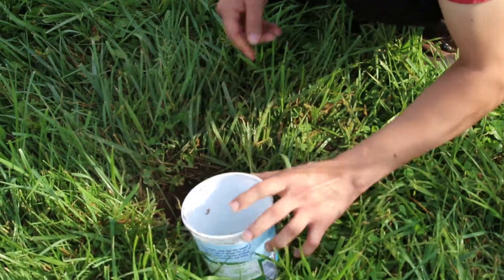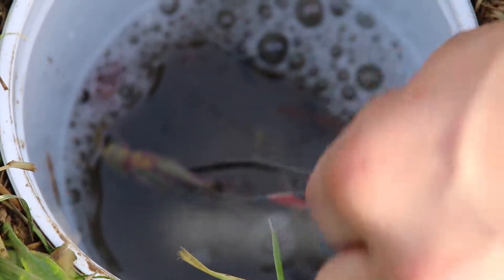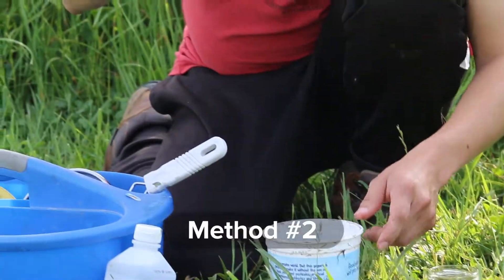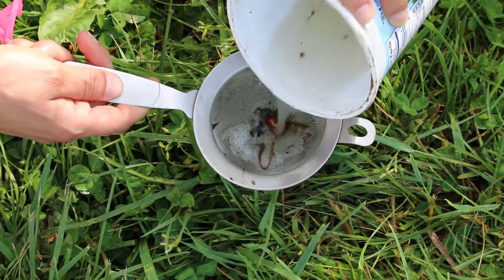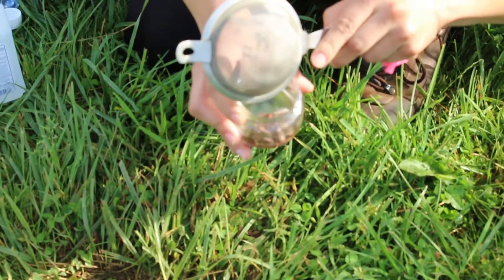For the first method, pick the insects up with a pair of forceps and place them in the small container. For the second method, pick up the cup and pour its contents into a plastic strainer. Then place the strainer on top of a small container and add all the contents gently into the container.